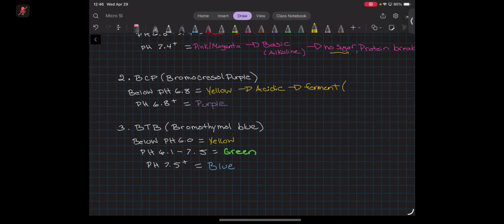It's purple, so what does that say? Lactose, very good. So that's where the dairy products came in. It's because lactose is a type of sugar. And purple, neutral. So it's no acid.